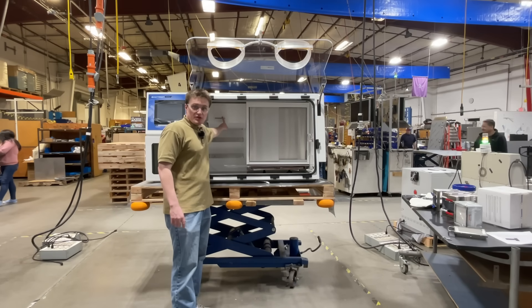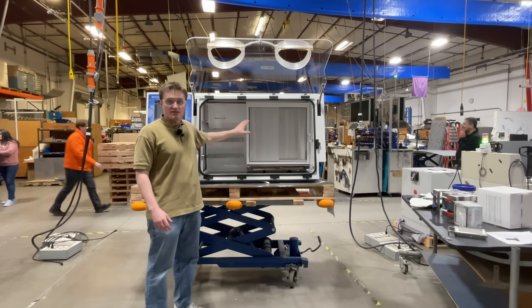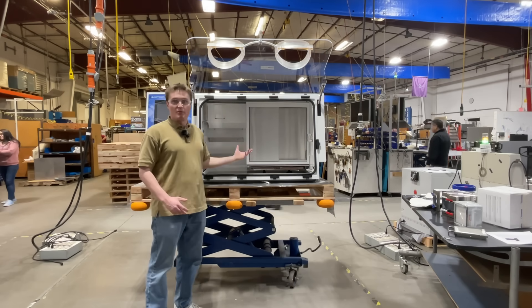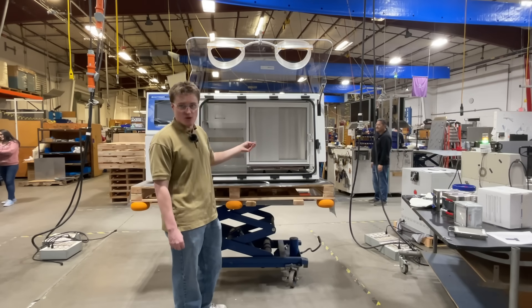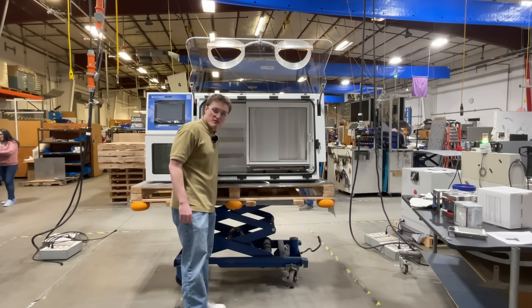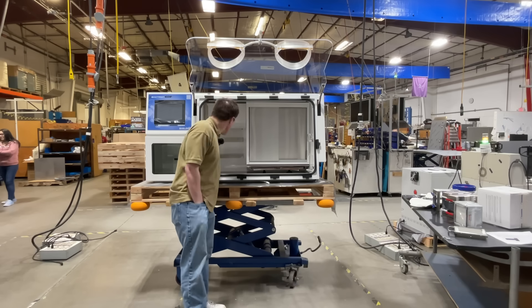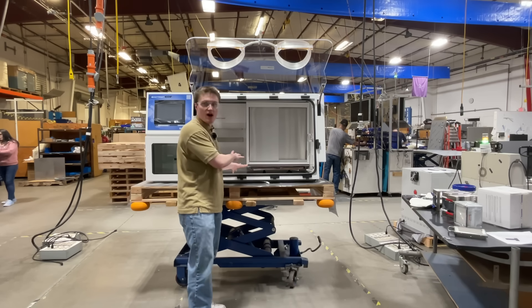We also have a HEPA filter located here. This will scrub the inside of the chamber while it is in operation. For details on clean room status, please visit our website. Then we have our convenience outlet. This is used to power any auxiliary devices that you want to have inside the chamber while it's in operation.